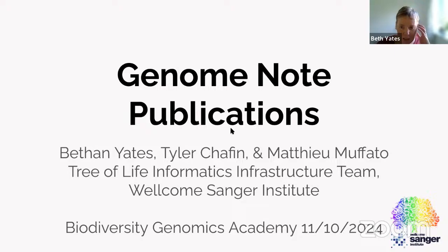So I'm going to be talking today about the work that I've been doing primarily for the last 2 years in the Tree of Life project on automating our Genome-Note publications.